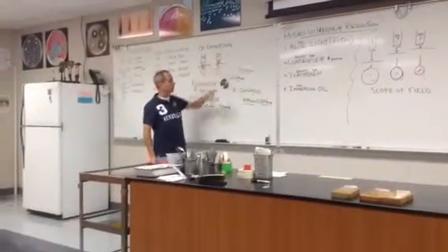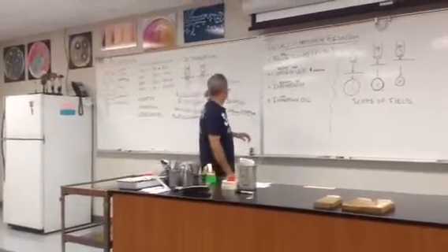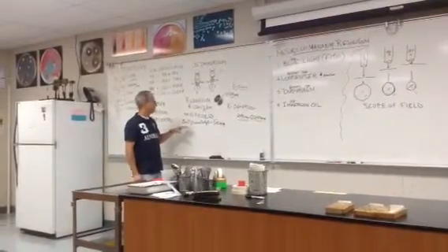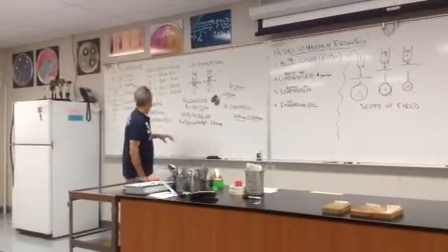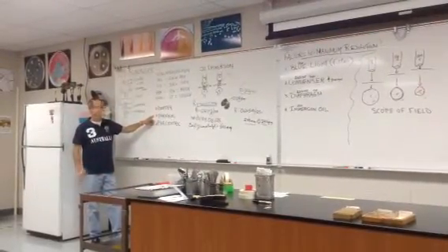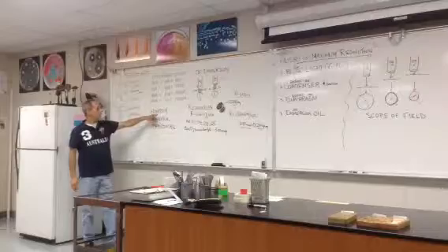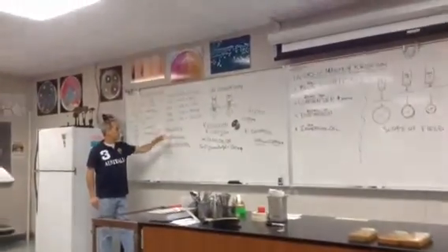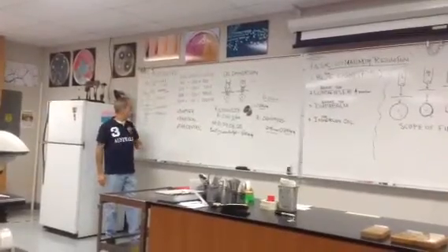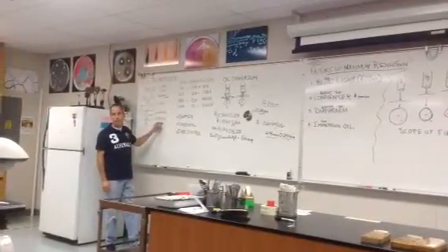Agreed? Yes. Right? Next, what I want you to think about, I will decide whether I'm going to have you calculate numerical aperture or not. I've talked about the terms parfocal and parcentric last time, did I not? So I don't have to talk about them now. The diaphragm is the opening that opens and closes when you adjust it.